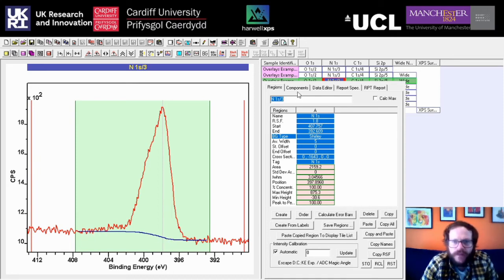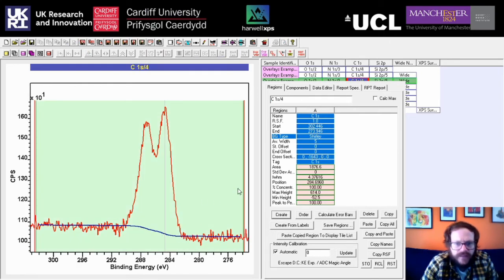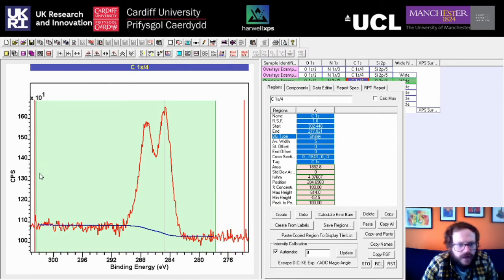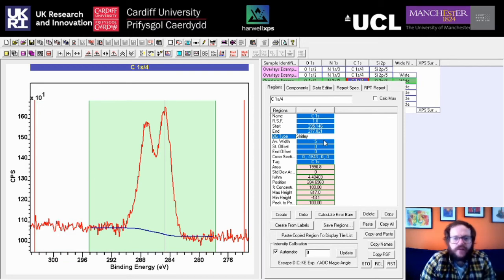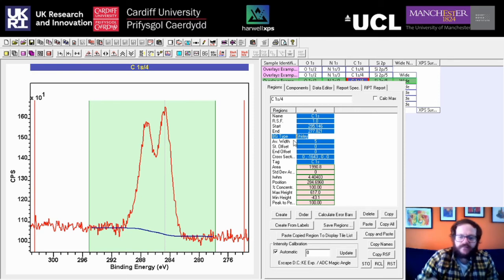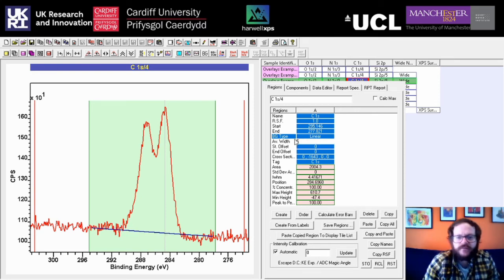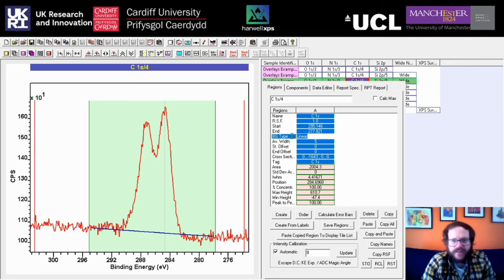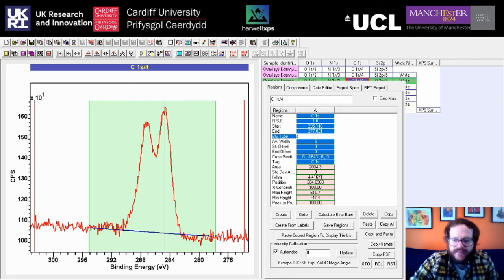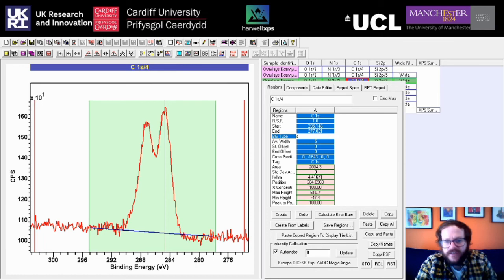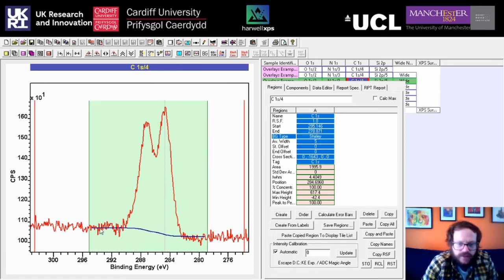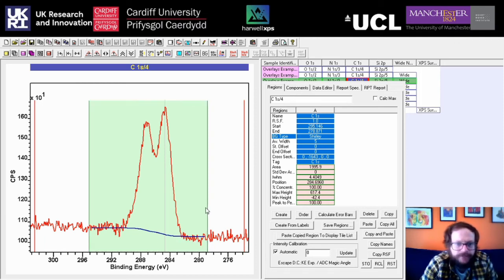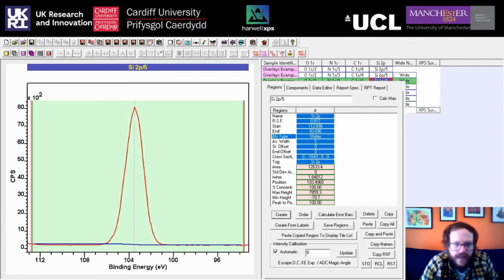You really want the background line coming through the middle of the noise. That looks pretty good. Moving on, we'll do the same for our Carbon. A quick point on background type: there are two very common options — Linear and Shirley. Type S and Enter to set the Shirley background type, which is just a little bit better than the linear version.